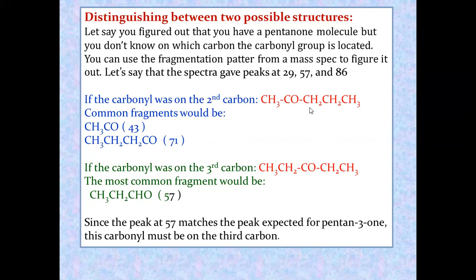But if I get in my chart the appearance of one acylium ion, that means I'm going to have one acylium ion. Because in the case of 2-pentanone, the R group here is not similar to this one. Here I have a position of dissimilarity. It's not the same. But in the case of 3-pentanone, here I have ethyl and ethyl. So in the case of 3-pentanone, I'm going to have one acylium ion. But here I'm going to have this type of acylium ion, and another type of acylium ion.